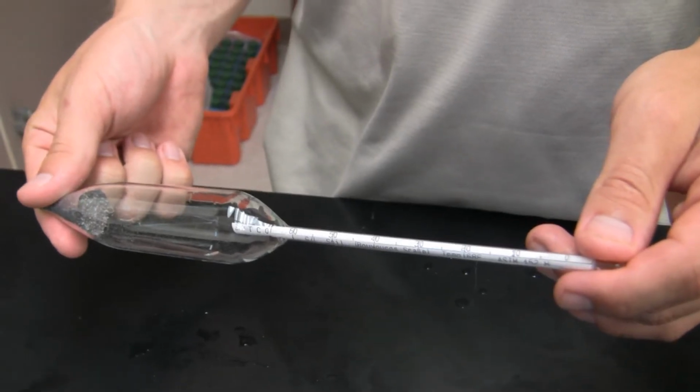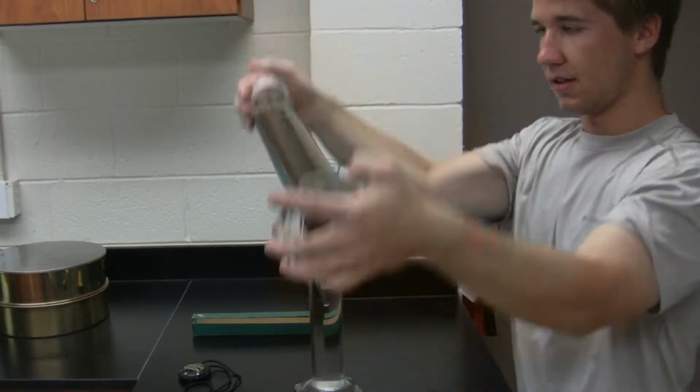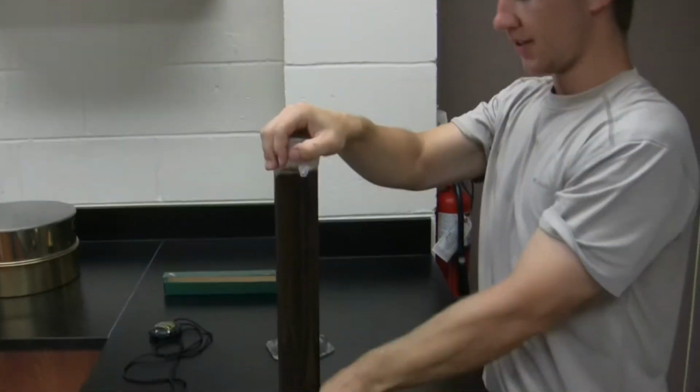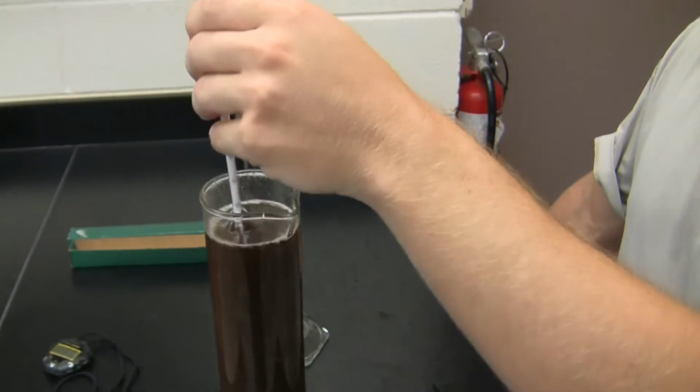In order to determine the soil texture of our soil, percent sand, silt, and clay, a hydrometer test was used. A hydrometer is a device that measures the specific gravity of a solution. By taking hydrometer readings at various times, we can determine the percent sand, silt, and clay still in solution, based on the principle that different sized particles will fall at different rates.